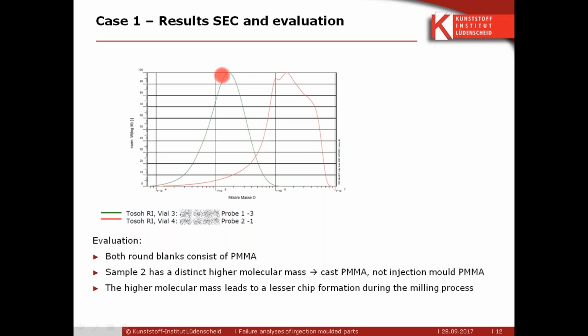And you have a maximum, but you often use not just the maximum, but you work with the weight average of the molecular weights. It's a bit more complicated to explain in just 5 minutes or 2 minutes. So if you want to know more about it, maybe we can talk afterwards, or I can use some more sheets about this and show you some. Okay, that paves the way for a new webinar.